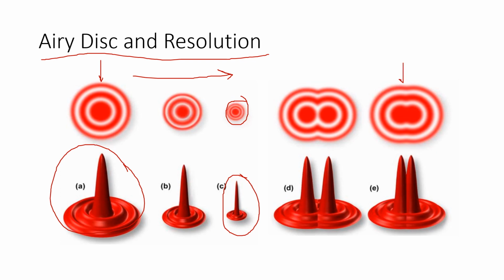This figure shows you the limit of resolution. The centers of the airy disks are separated in such a way that you have just reached the limit of resolution. If they were a bit closer than this, you would not be able to resolve them. But by increasing the separation further, you can very easily see the separated particles distinctly.